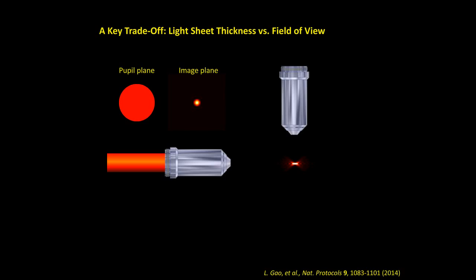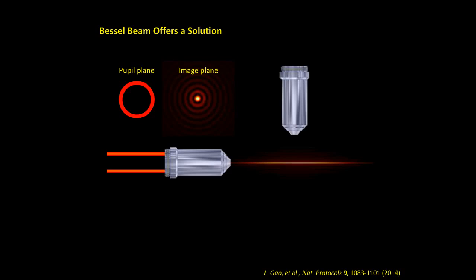So in our group, we invented another optical property we call the Bessel beam excitation. The Bessel beam is a kind of ring excitation. If you send a ring, then at the focal plane it is a Bessel function, because the objective itself is doing the Fourier transform.